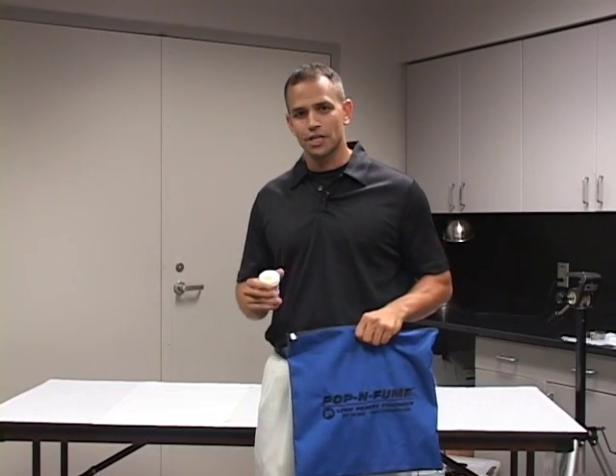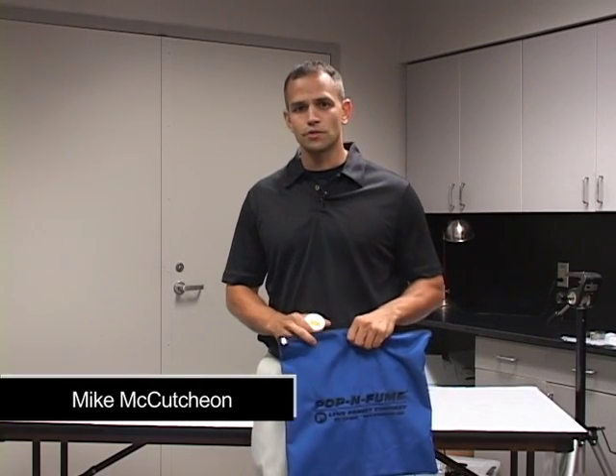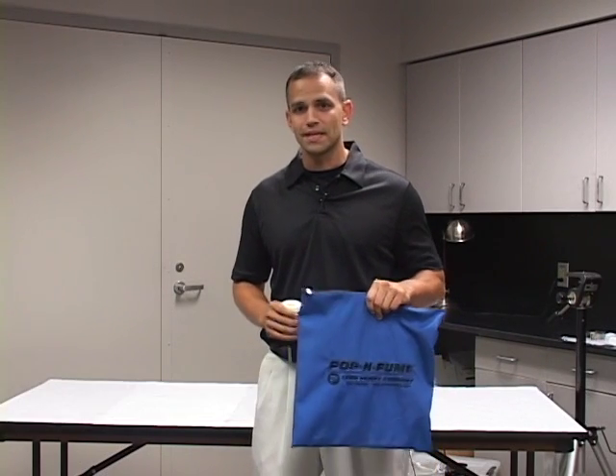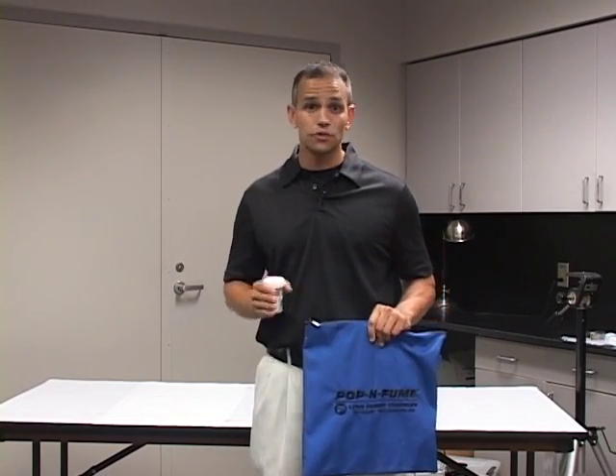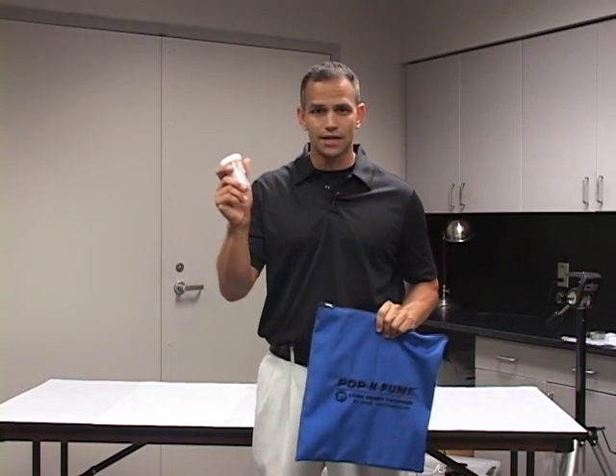Hi, welcome back to Forensic Educational Series. I'm Mike McCutcheon. Today I'm going to show you how to do portable superglue fuming, make it easier, either in the classroom or at a crime scene, using the contents of this bag and a hot shot.